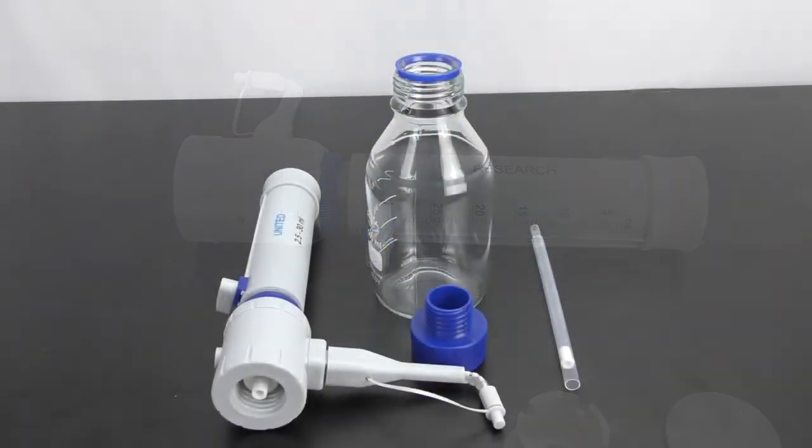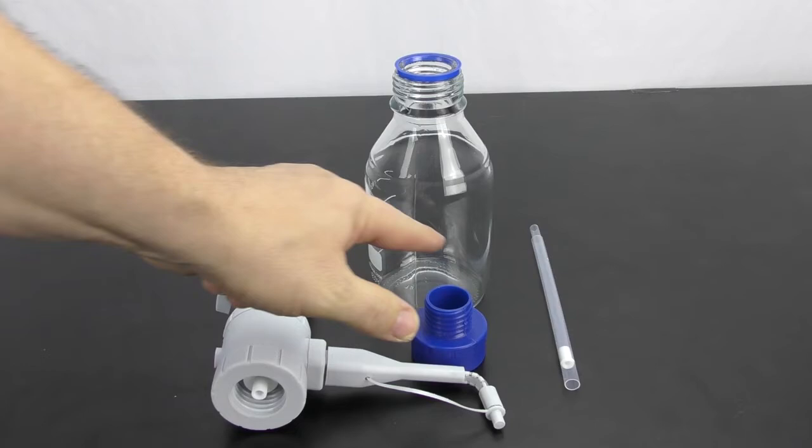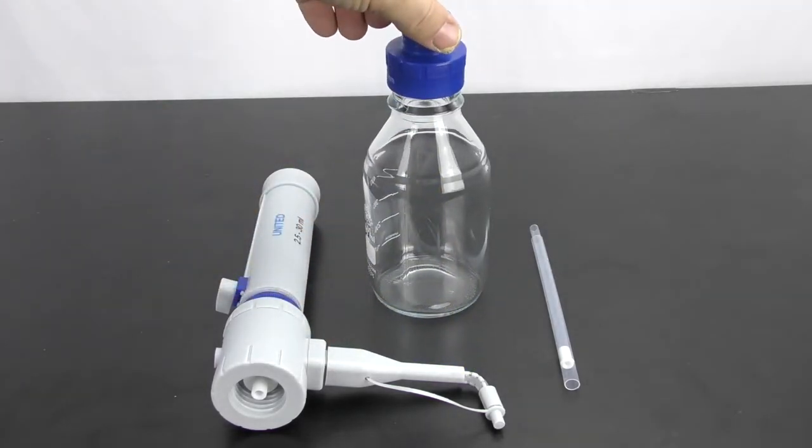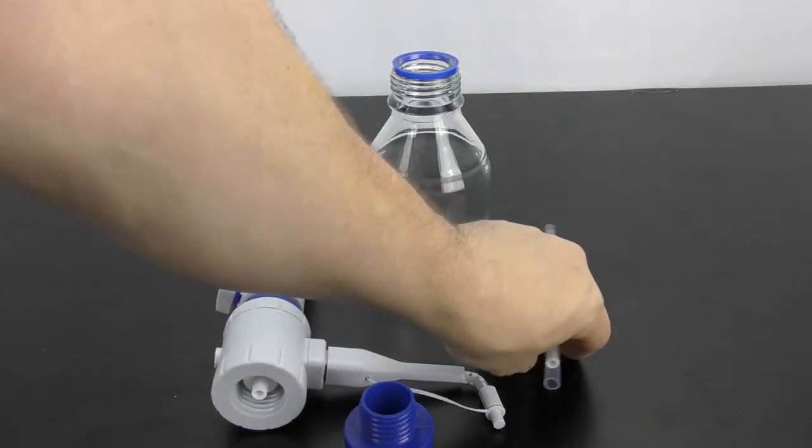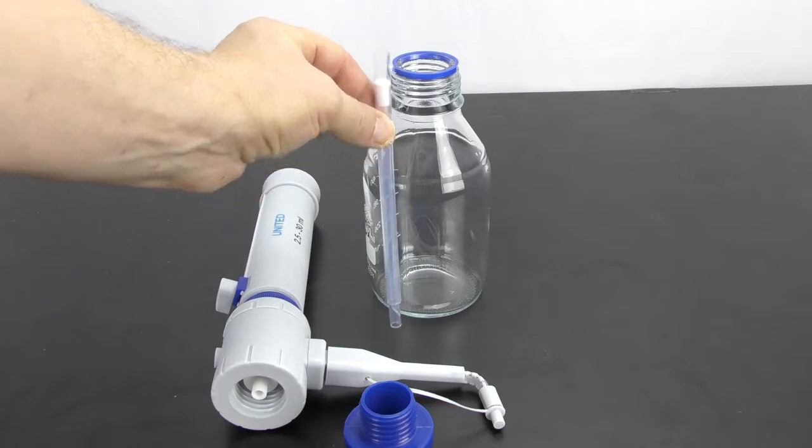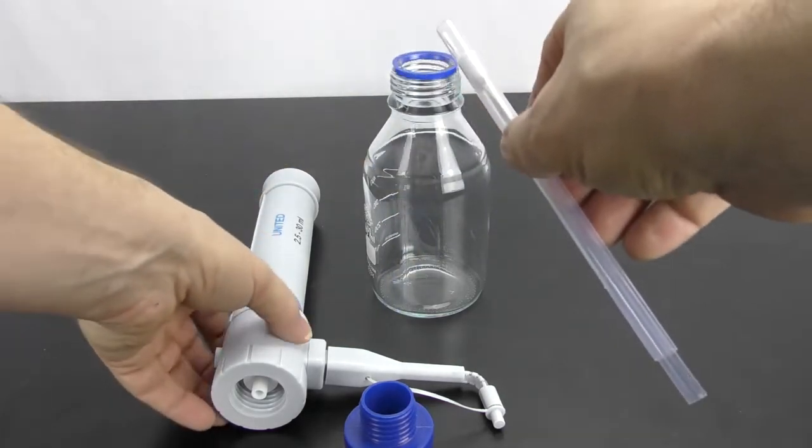Assembly is very easy and straightforward. I find the appropriate adapter that fits my media bottle. I adjusted the height of the straw so it reached just the bottom of the bottle. Then you just put them all together.